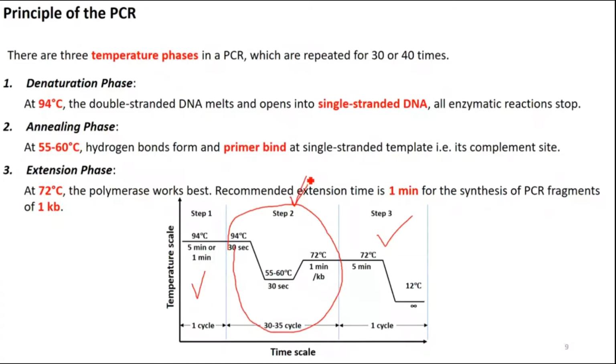And the third step that is also the principle of PCR is the extension step that is performed at 72 degrees centigrade. If this step is longer, like 18 minutes, for longer extensions of DNA fragments, sometimes we decrease this temperature to 70 degrees centigrade and even to 68 degrees centigrade in some cases, but usually we perform the usual routine PCR at 72 degrees centigrade.